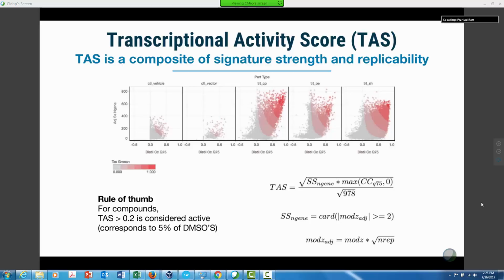Yeah, I had a question in terms of the CRISPRs targeting genes. There are multiple guides per gene, correct? Yes. And is there a cutoff that you're using as to how many guides you would require per gene in order to include this in the analysis?